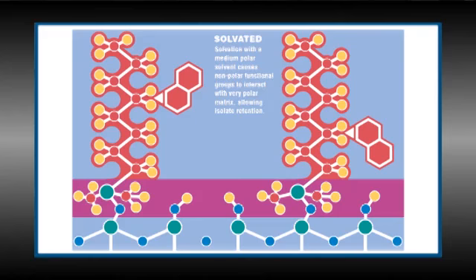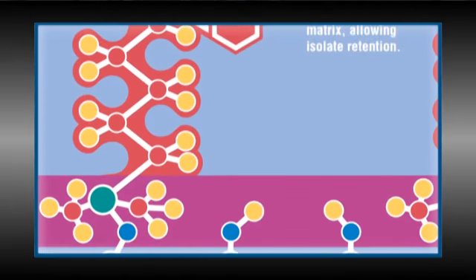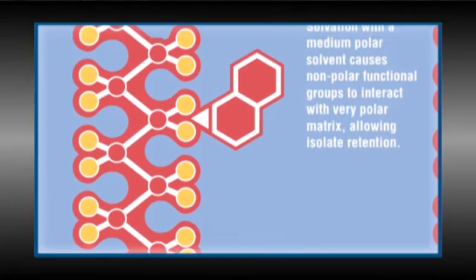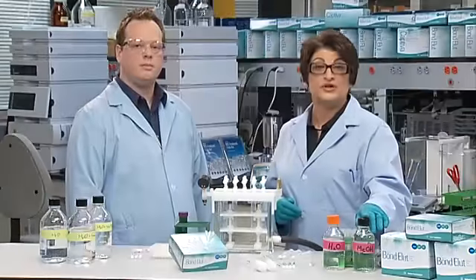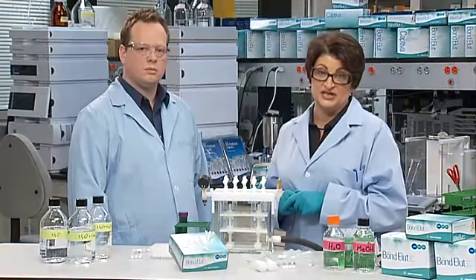It is one of the biggest influences on the maximization of efficiency and capacity of the sorbent bed. SPE material must first be conditioned with an organic solvent. The purpose of the organic solvent is to solvate the nonpolar functional chains, like C18. It is also important that these phases not be allowed to dry out once they have been conditioned.